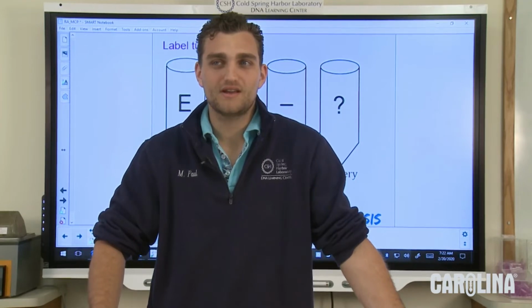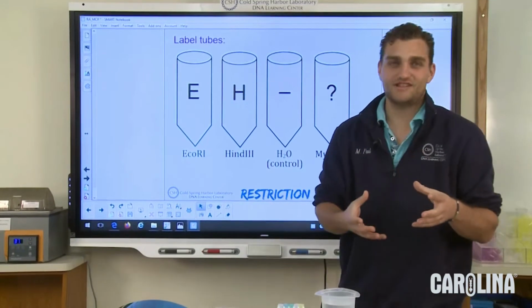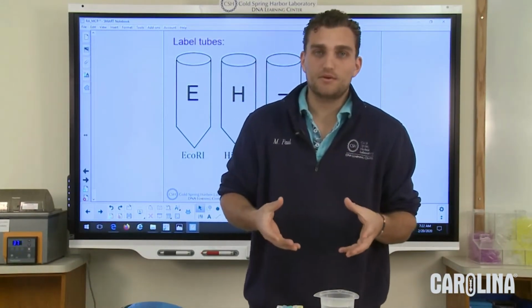What do you think? People. Yes, it's human body temperature. So that is a really interesting thing. These enzymes work best at human body temperature. And that is not really surprising when you think about it, what do we have?